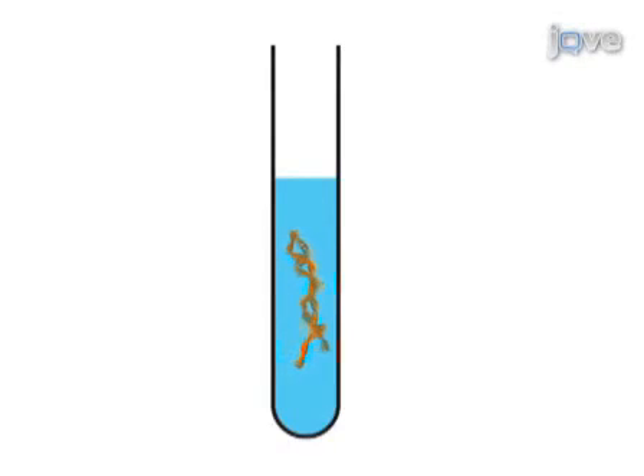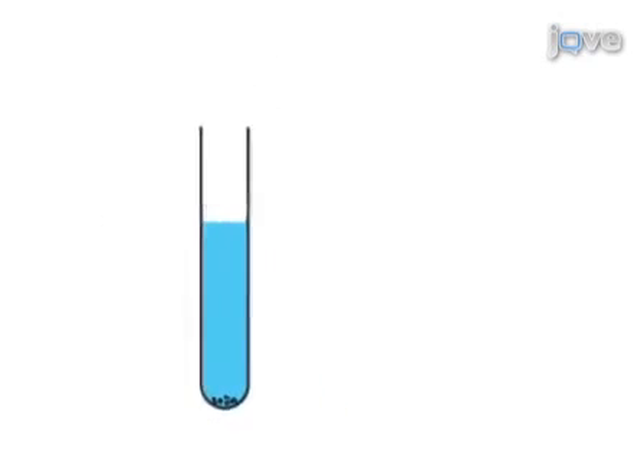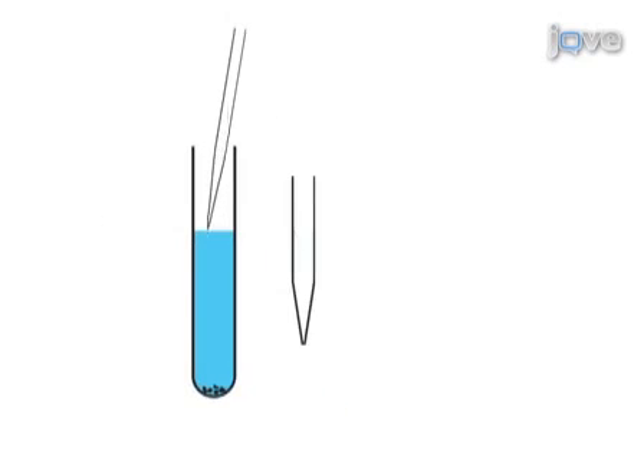In the first step of this injection procedure, a working concentration of DNA solution is centrifuged to sediment particulate matter. Injection pipettes, fabricated from borosilicate glass capillary tubing, are then filled with the DNA solution.